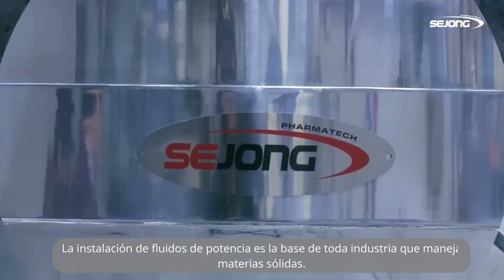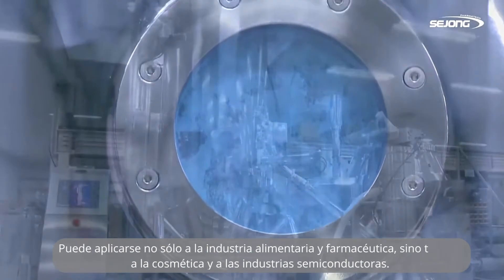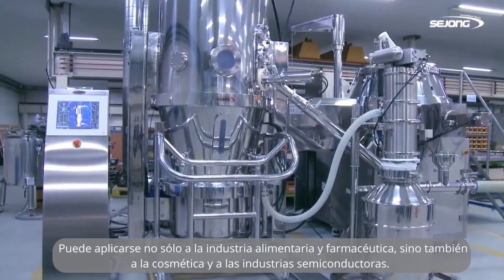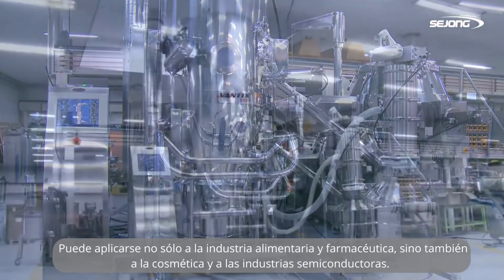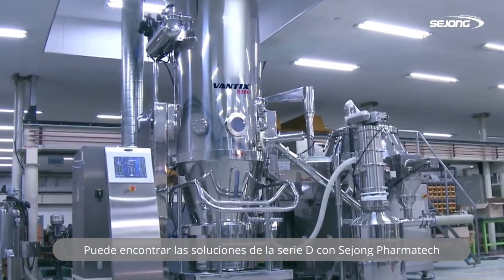The fluid bed system is the basis of every industry that handles solid matters. It can be applied to not only food and pharmaceutical industries, but also cosmetics and semiconductor industries. You can find the solution, D-Series, with Sejong Pharmatech.